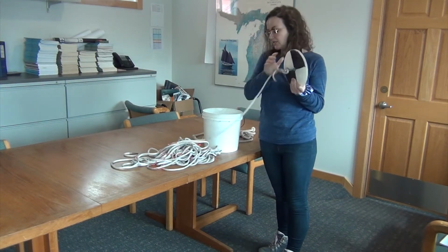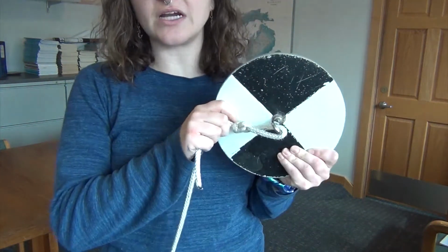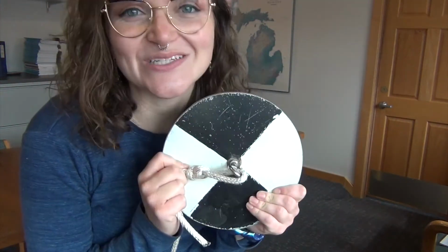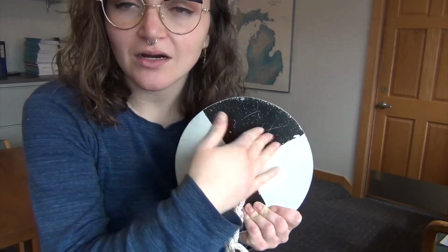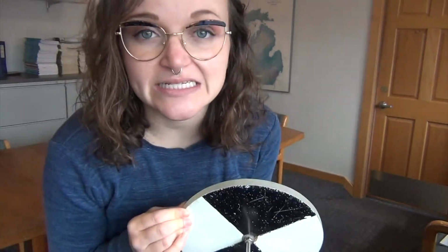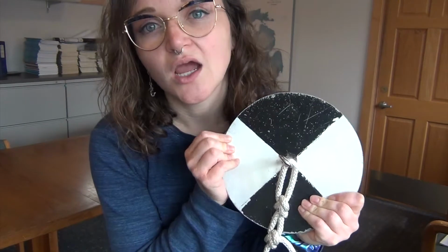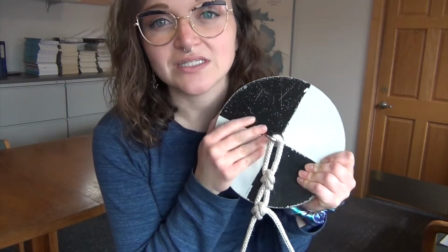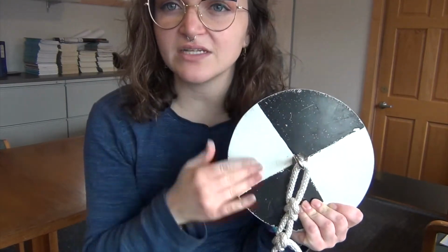So these Secchi discs are ubiquitous in marine sampling as well as freshwater sampling. Jillian just told me the kind that they use in marine sampling is a little bit bigger and it's all white. But you'll notice that ours has this highly visible black and white pattern for us to be able to see it nice and easy. This is the exact same equipment that is used on research vessels all around the country. So this is a really great time to really show the students and really hammer home that we're doing real science on the boat. So we have the disc itself.